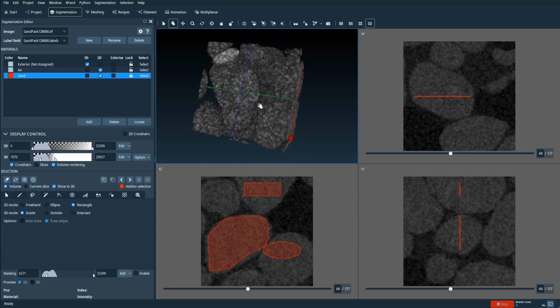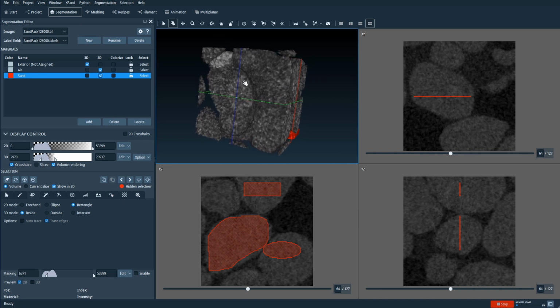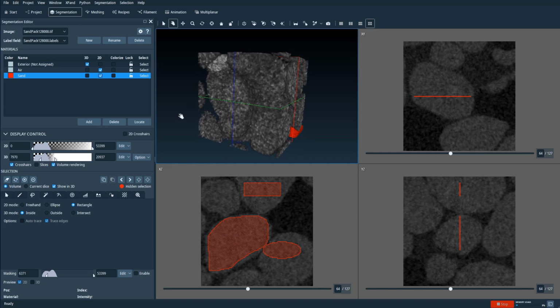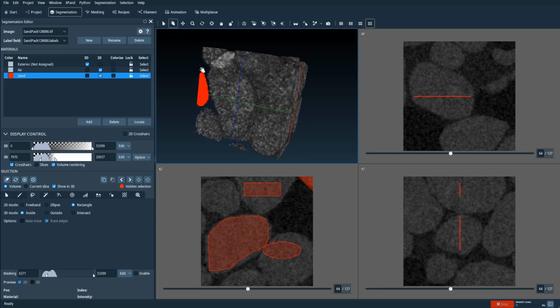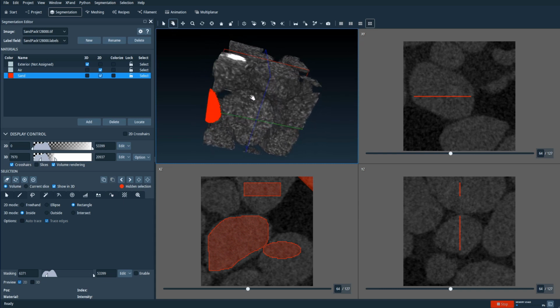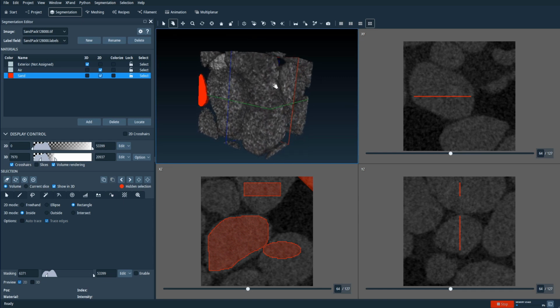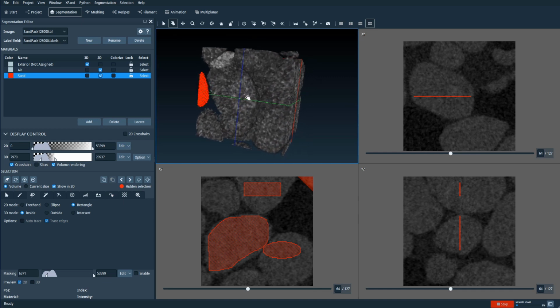What I like to do is usually isolate the region that I want to select, like this one, if you can, and then draw the contour in there. So click the Lasso tool again and draw the contour like this. And don't forget to click the trackball here if you want to move around, because otherwise clicking in the 3D view will draw a contour again.